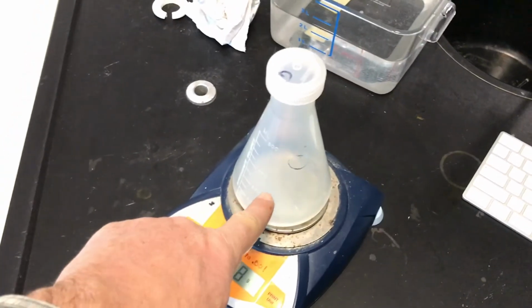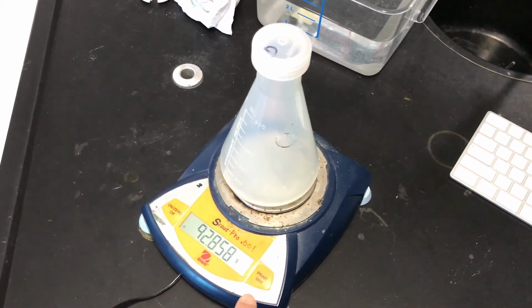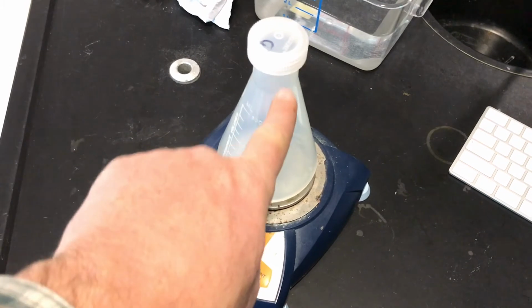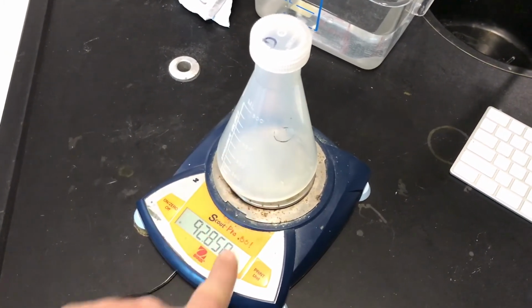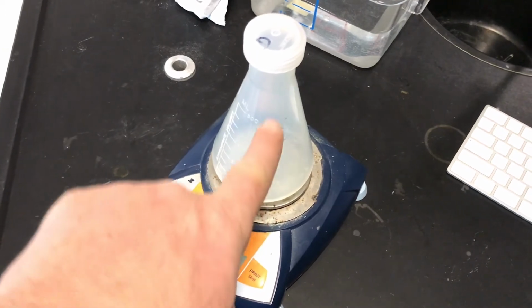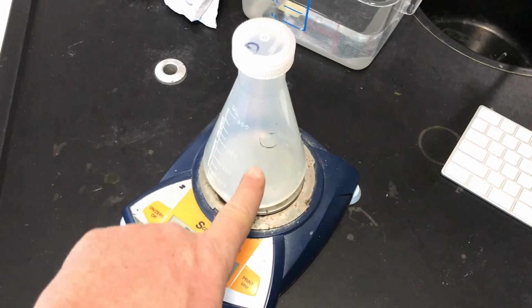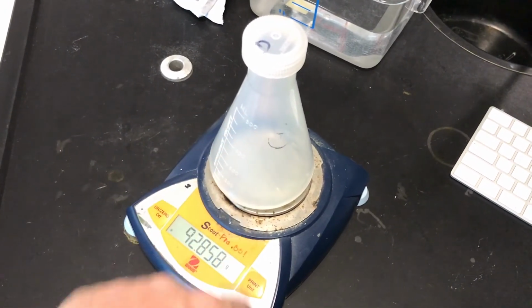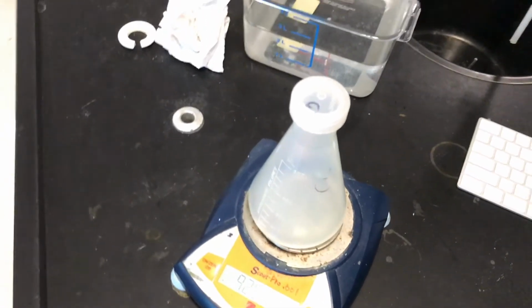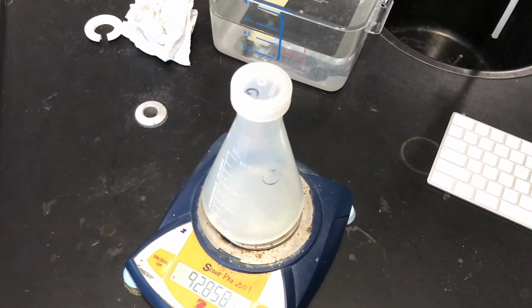Subtract the mass of the air, found by using the density, from the mass of the air and the container, and now you have the mass of a dry, evacuated container. Kind of cool that we can do it without, because it's very difficult to take all the air out, because it wants to seep back in because of entropy.